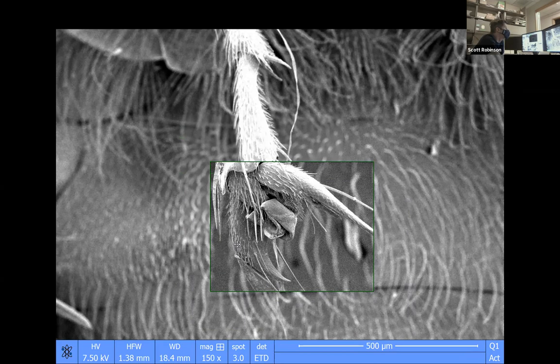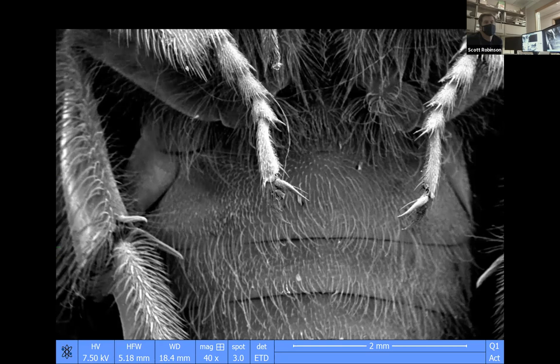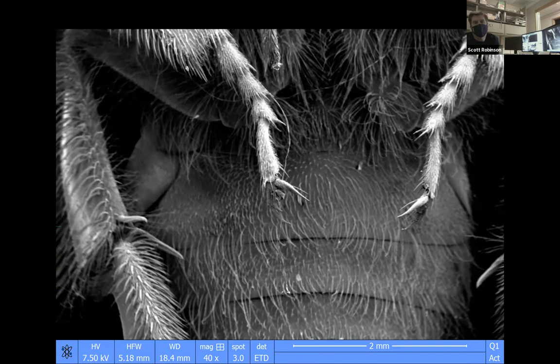The chat has requested a re-explanation of why what we're seeing is black and white and not in color. What we're doing is beaming electrons at the sample, and the things we're looking at are so small that we probably wouldn't be able to see color anyway. Color is a wavelength of light. We're using electrons, which are much smaller than the wavelength of light. So we have a very, very fine stream of electrons constantly rastering across the sample, much, much smaller than the wavelengths of light.